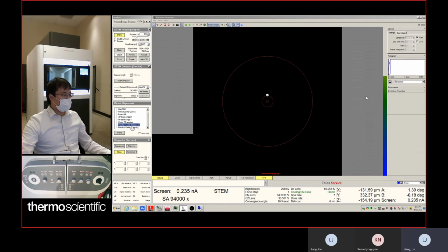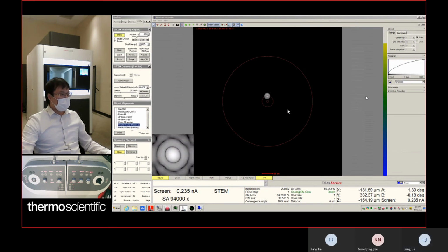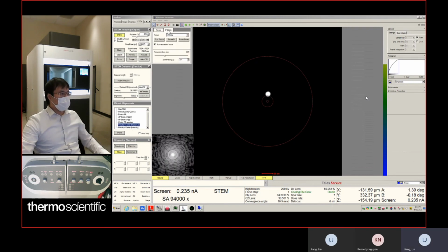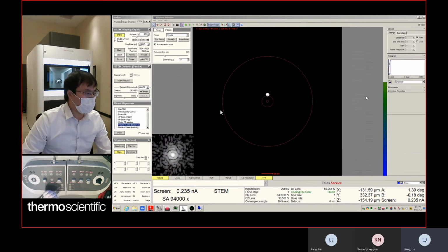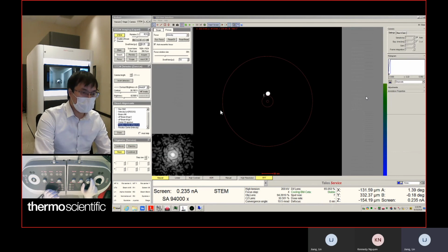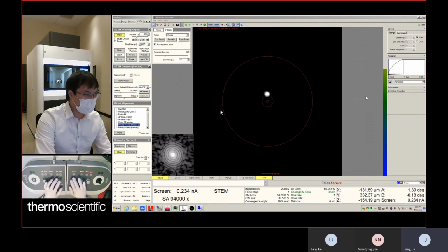So if you set the rotation center objective, you bring an objective wobble through the objective lens. So make sure in this case you can use multifunction X and Y to make it wobble concentrically. Another quick tip here is to use multifunction X and Y to make sure it wobbles concentrically.